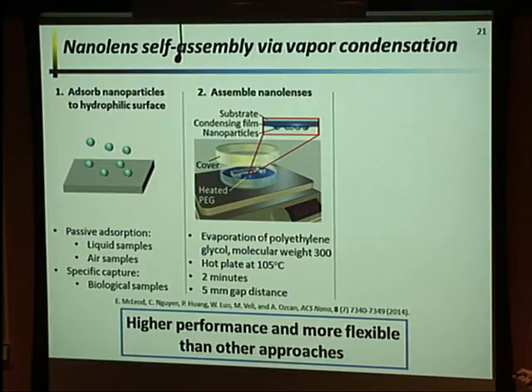The reason why we're using polyethylene glycol, a couple reasons. It's non-toxic, so you don't have to worry about doing this in a fume hood, is one major reason. The other reason is since we're using a polymer, we can control the molecular weight, and this means we can kind of control the rate of evaporation at different temperatures. So we do this for a couple minutes so we don't have to wait too long.